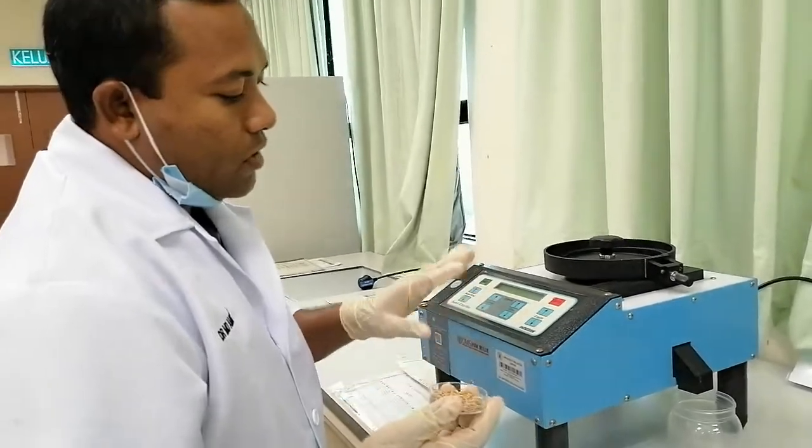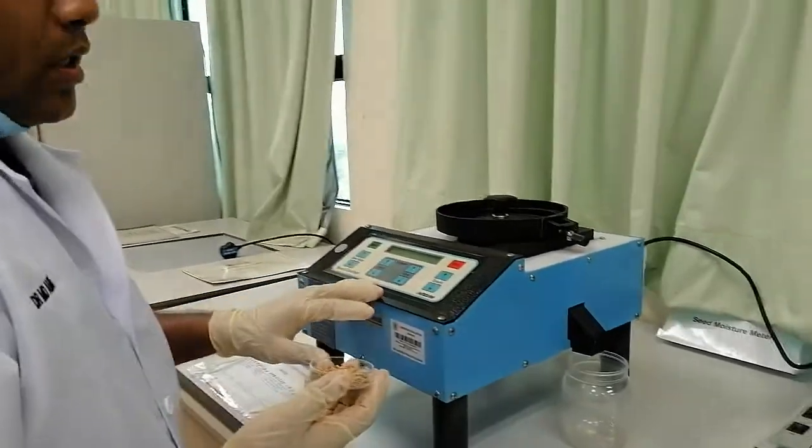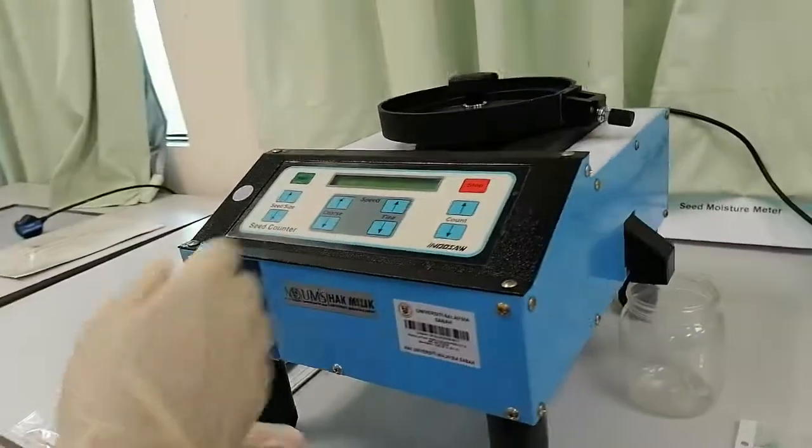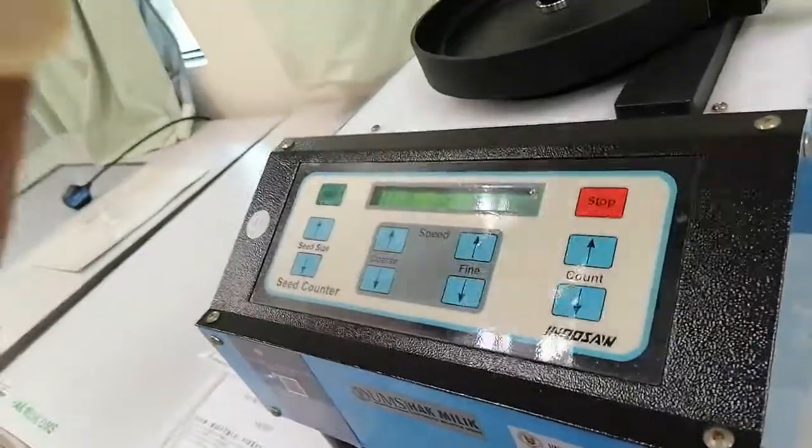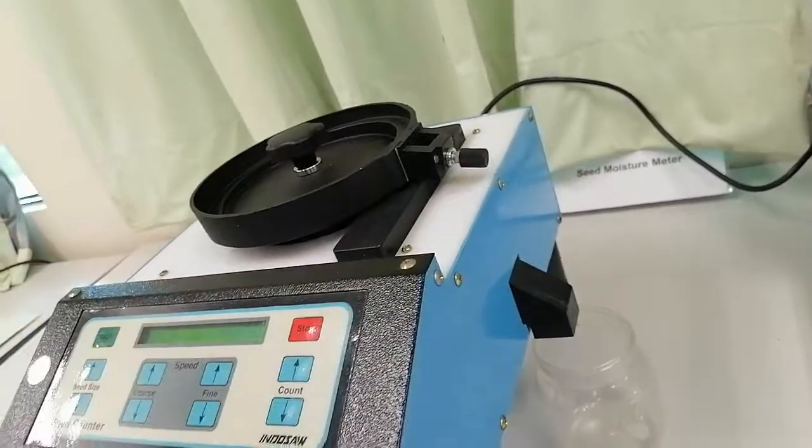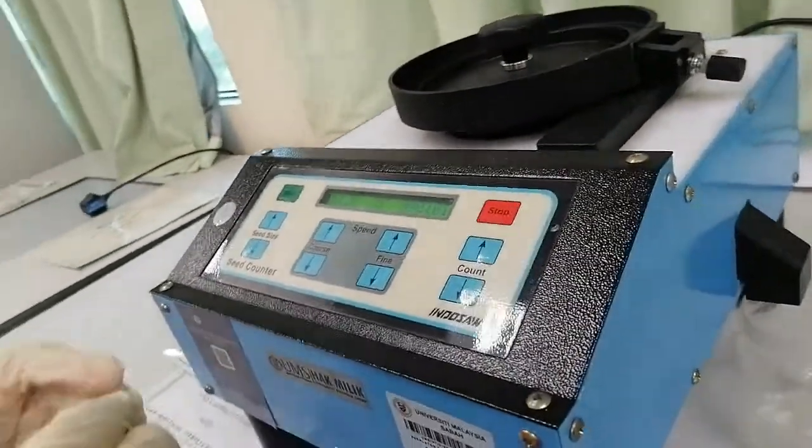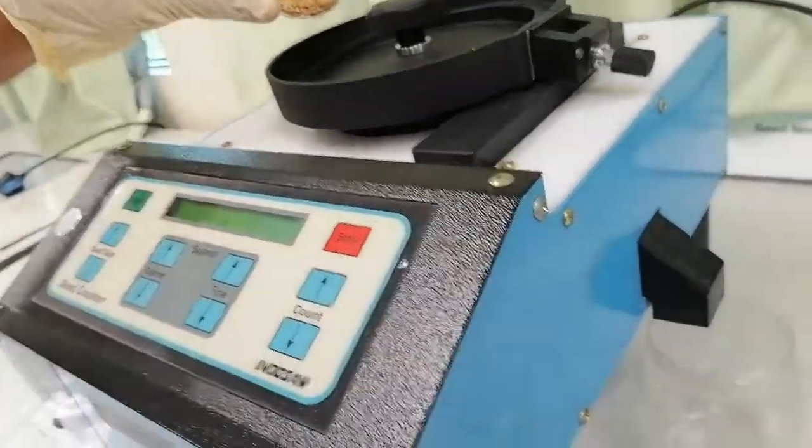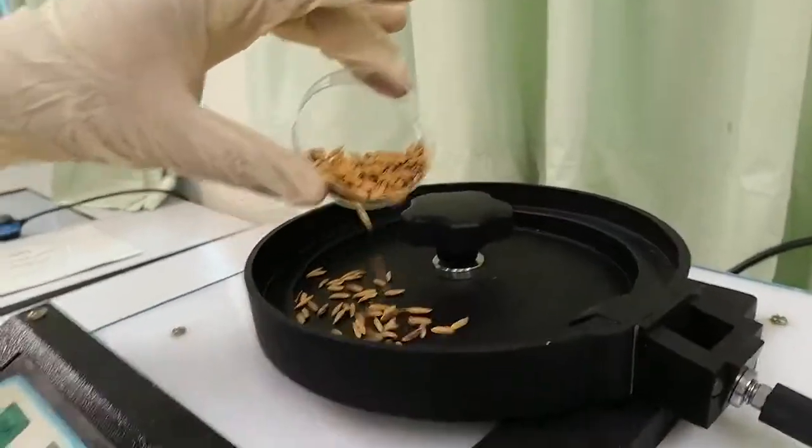So for that purpose there is a machine seed counter, electric seed counter you can see. There is a power cable already connected with the power. So this is the on off button. Before we turn it on, we can keep some seed here. So this is the inlet.